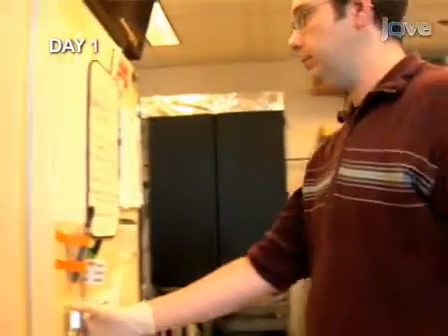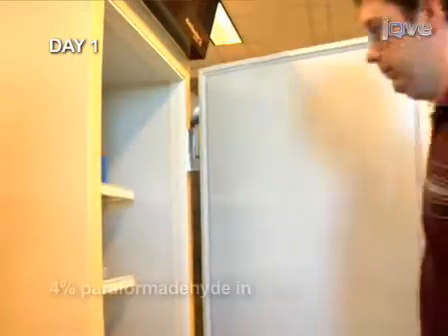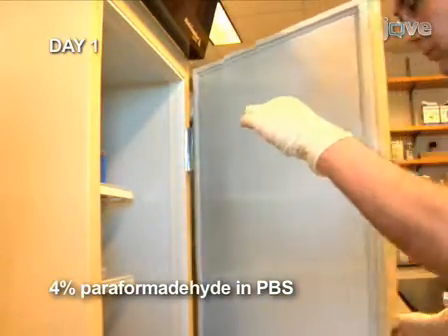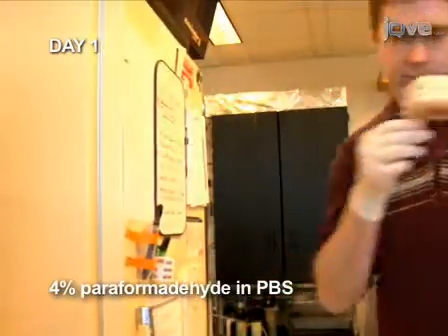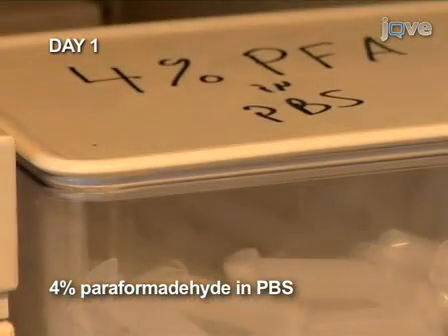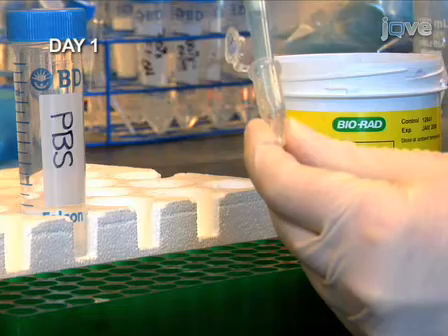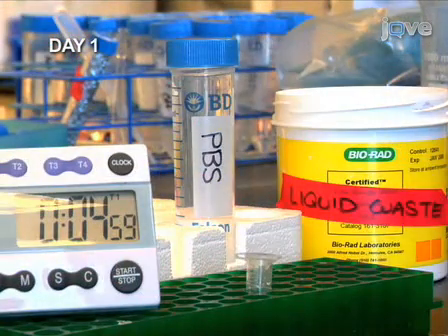Begin the procedure with embryos that were fixed overnight in the cold in paraformaldehyde. Using a freshly thawed stock of paraformaldehyde for this fixation is critical for successful staining. Remove the fixing solution and wash the embryos at room temperature twice for five minutes each time in PBS.